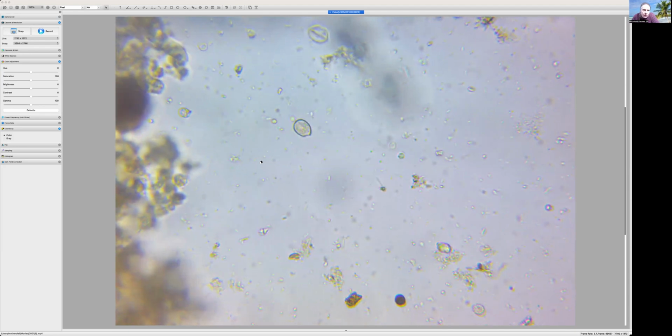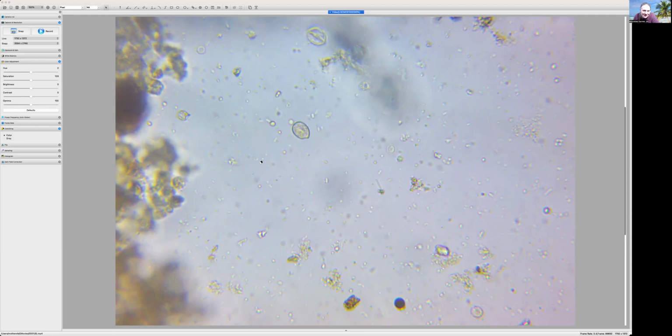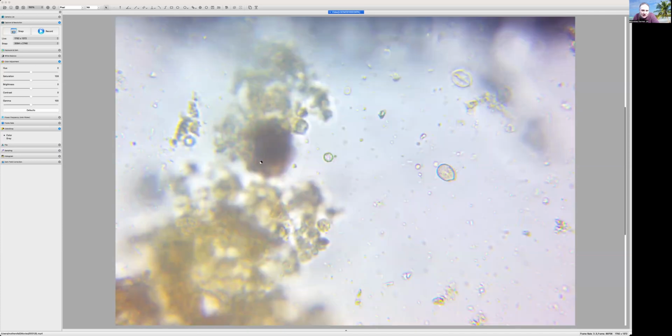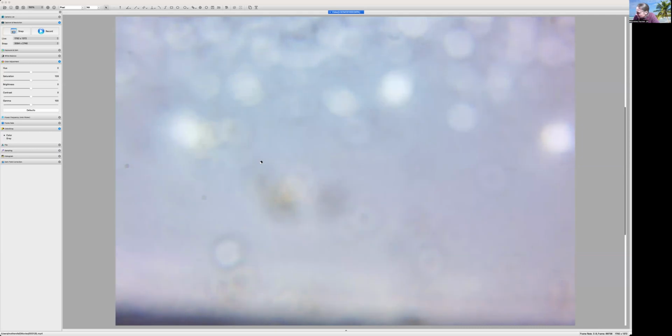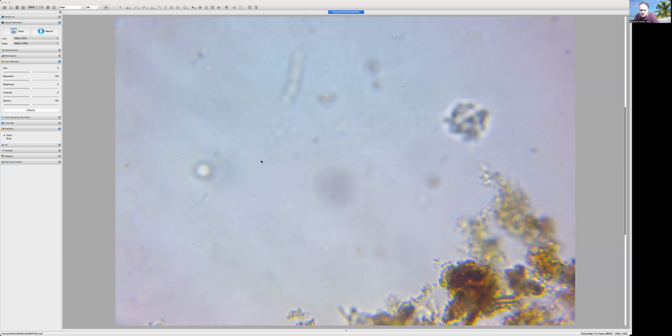So, oh, there's Miss Nematode. Let's go look at her. I want to, don't you? There she is. Wonder if we can get a shot of her mouth. Oh, we're at the edge of the darn slide, so I don't think we're gonna get to see her much. No, but she's there. Find a new spot here towards the center so we don't run off.